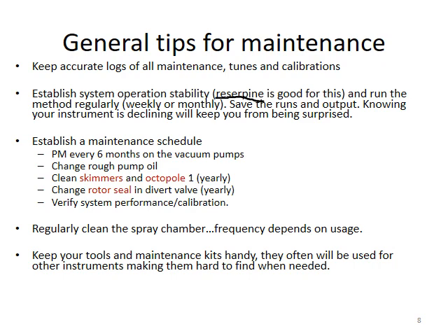And some of the tasks, like what I mentioned here, you should do in a routine way. But some of the work can be done by the service engineer if your instrument is insured under a certain agreement.